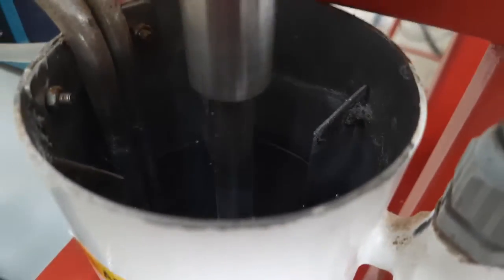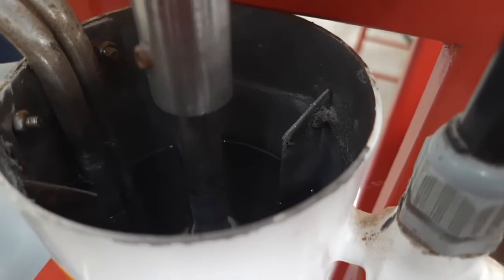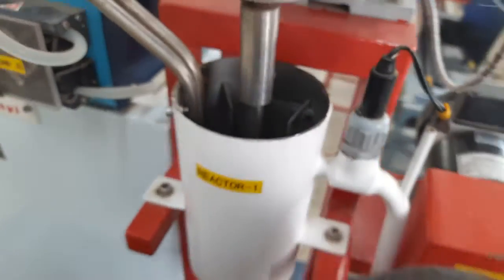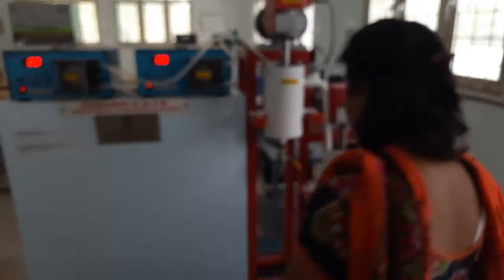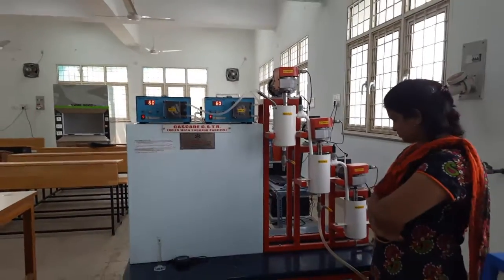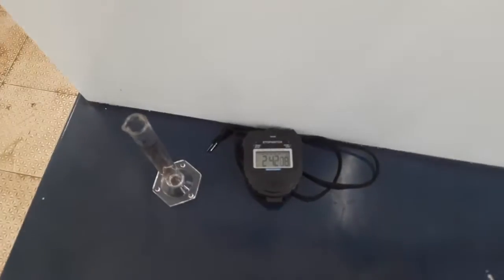Actually, in a regular laboratory, you can go as low as 10 RPM or 8 RPM. Now we are using a higher speed so that we can save time. Keep checking whether there is any blockage so that we are able to identify it. It may take around 5 to 10 minutes.